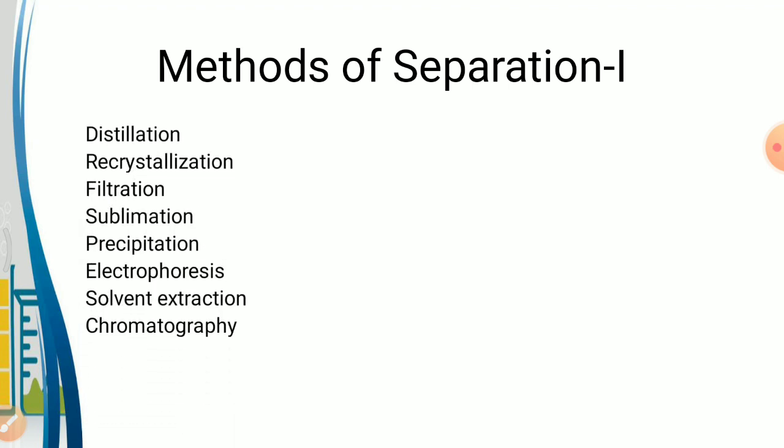So basically, analytical chemistry deals with separation, identification and purification of the analyte of interest from a mixture of various components. As there are n number of unwanted components present with our analyte, separation plays an important role in analytical chemistry. Separation can be defined as an operation by which a mixture is resolved into its components.